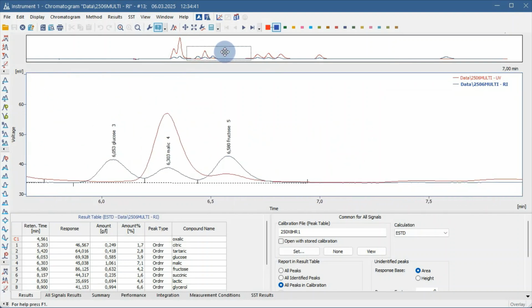All the zoom tools, including mouse gestures, keyboard shortcuts, and menu commands, along with the preview graph, work together to give you full control over viewing details of the graph.